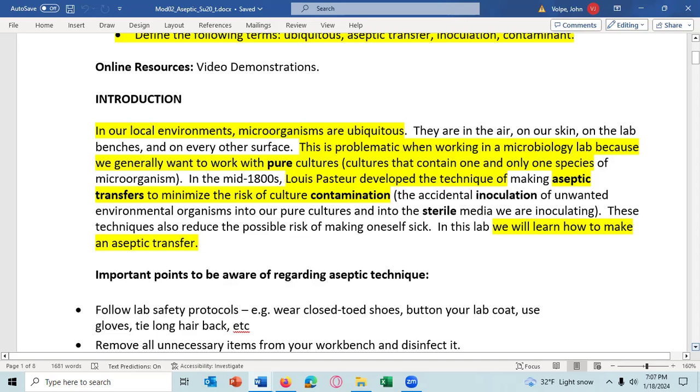If you have a mixture of species in there and the tube turns yellow, you don't know if that's from the species of interest or from some other species in there. If you only have one species in there and the tube turns yellow, then you know that the species is responsible for it turning yellow. Any questions about any of that?